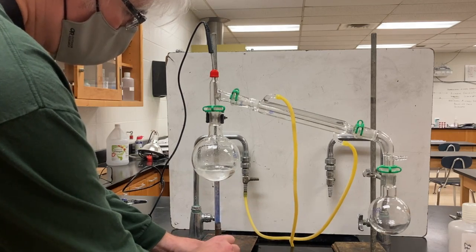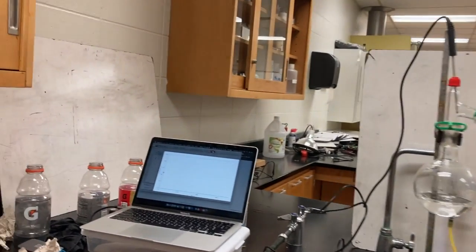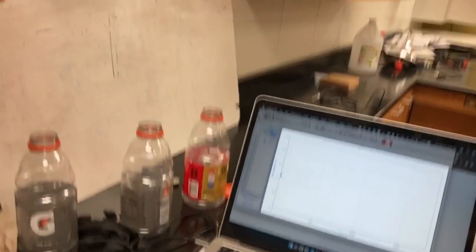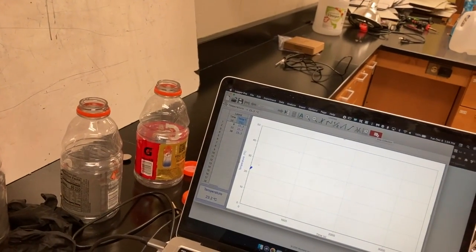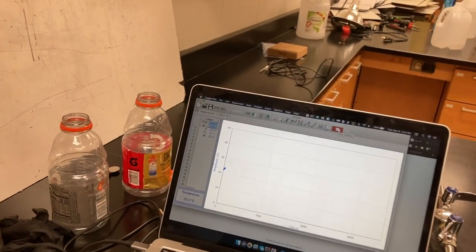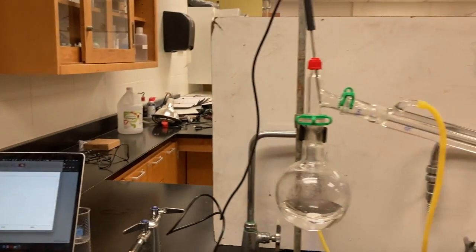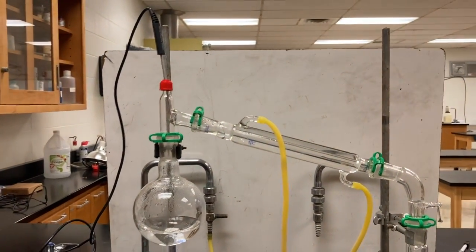I've lit my burner now, and I'm adjusting the flame to give a kind of a cool flame. Don't want to get too aggressive there. And I'm plotting the temperature on my laptop and recording the screen as I go.